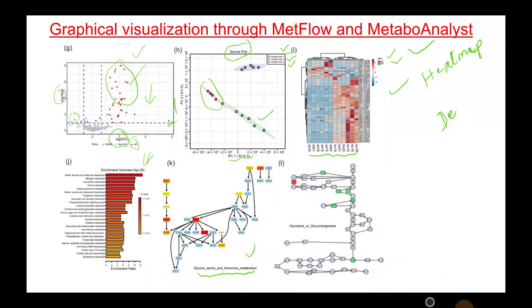So in MetaboAnalyst, it is a plus that you can also get the demo pathways. And here is also the demo pathway for glycolysis and gluconeogenesis. Here, this rectangular box represents a gene, and this round one represents a metabolite. One important thing to mention, if I can zoom in, I will later zoom in on the slides.